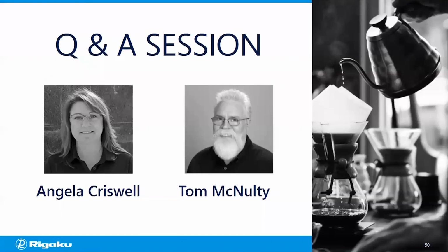Okay, next one from David. Setting includes voxel size and data collection time. So actually, I think he was looking for an answer to his question previously. What were the voxel size and data collection time? Oh, they varied for each of the samples. If you're interested in a particular one, by all means, please just drop me an email and I'm happy to fill you in on the X-ray energies that I used and the voxel size and data collection time for any of these. I'm happy to share that as well as the data sets themselves.